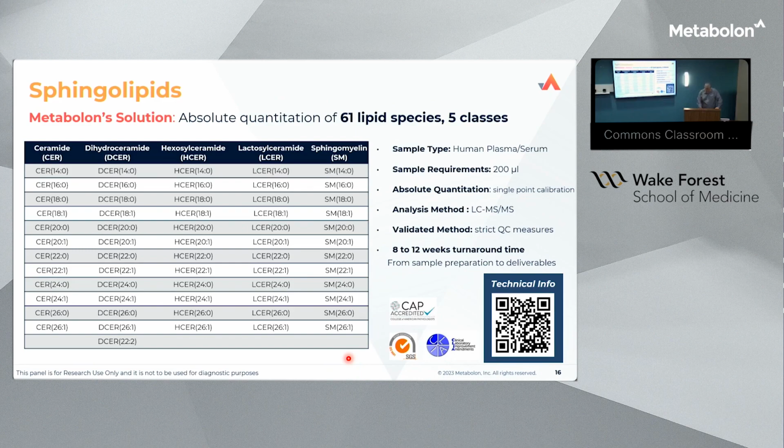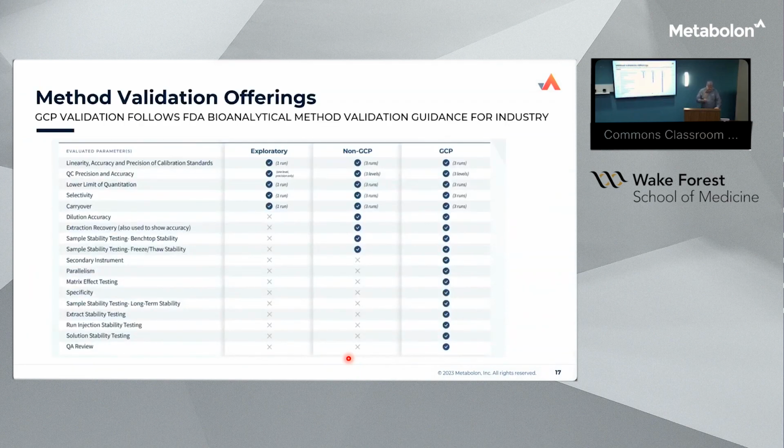we have. And once again, I mentioned earlier Metabolon's philosophy regarding validation. For our samples, firstly, we don't only validate it for the metabolites, we also validate it for each matrix that a client might want to test. And so metabolites behave differently in different matrices. So for a proper validated study, we have to validate it both for metabolites as well as matrix.